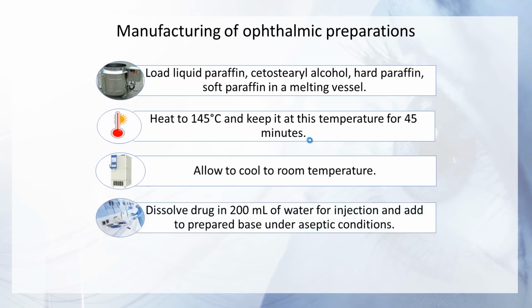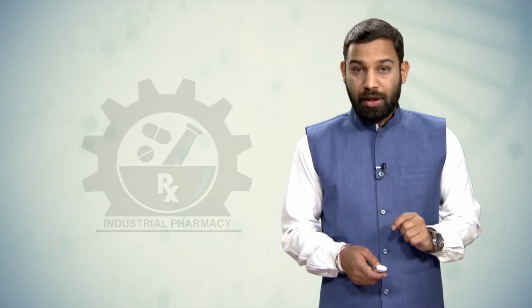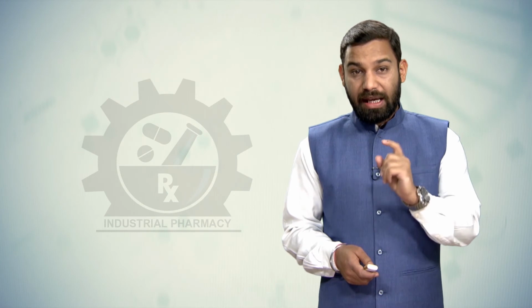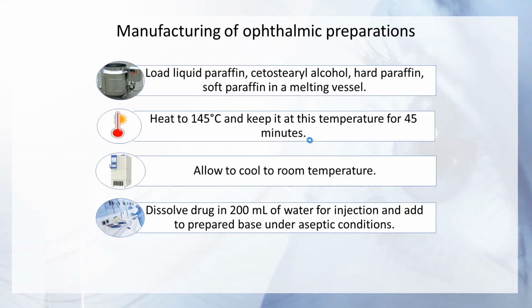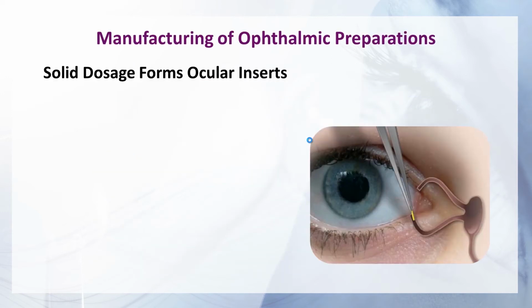In a separate vessel, dissolve the drug in 200 ml of water for injection and add to the prepared base under aseptic condition. So, you can see that we are using water for injection here. Why not distilled water? Because that should be sterile. Any vehicle we are using should be sterile, and water for injection itself is sterile already. Now, fill and sterilize the formulation in tubes, and how will we sterilize these tubes? By gamma radiation.